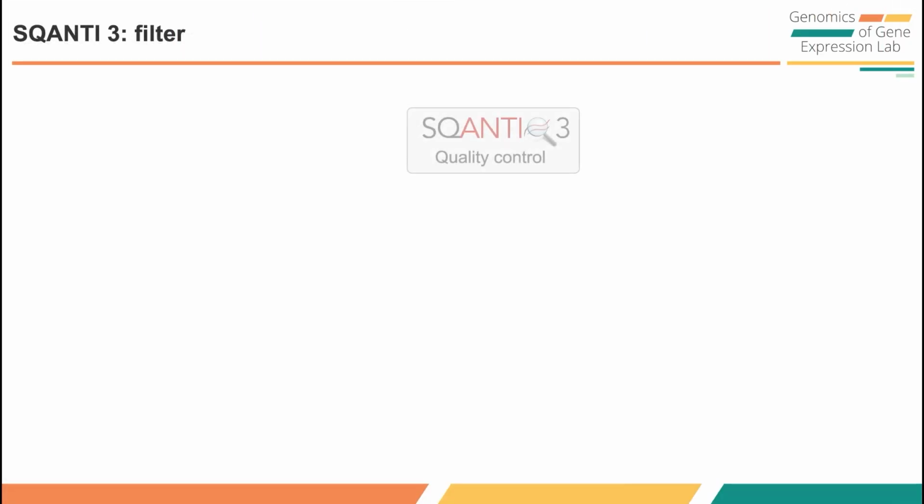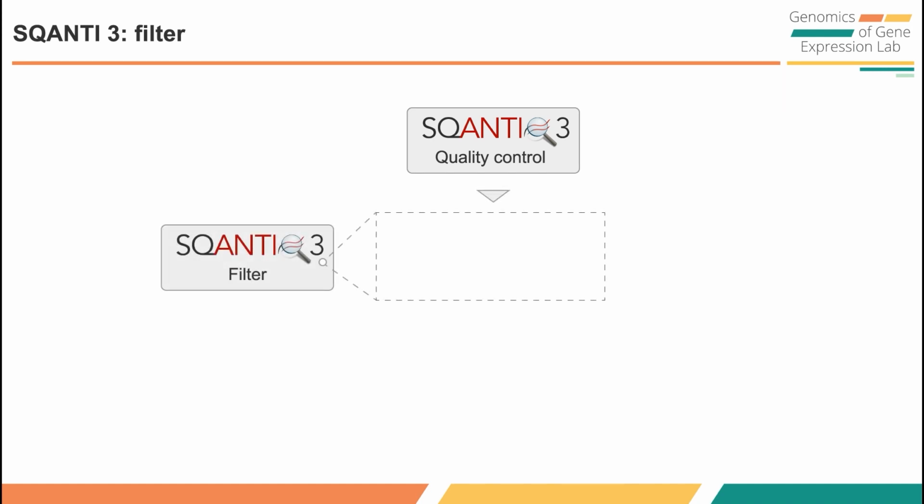After the SQANTI quality control, artifacts remain in the resulting transcriptome. SQANTI removes artifactual transcripts by applying a rules classifier or machine learning classifier based on the attributes obtained through SQANTI3 quality control.